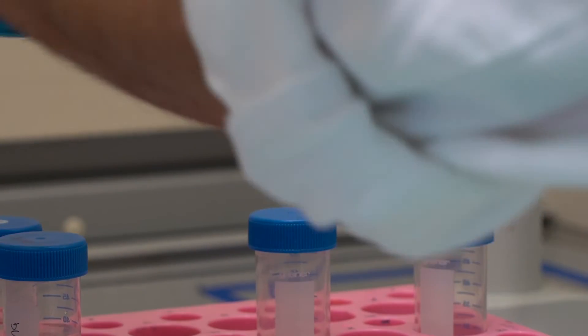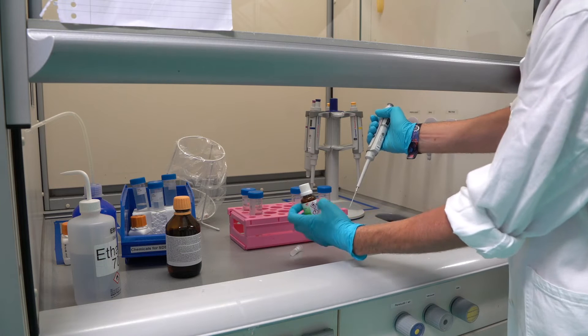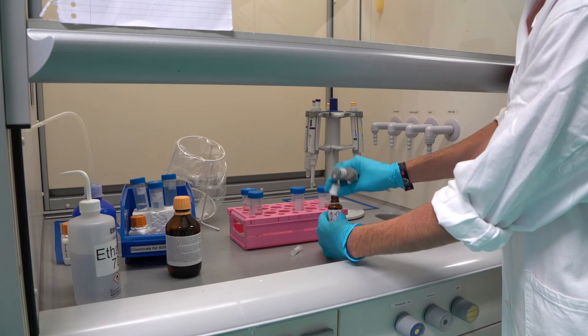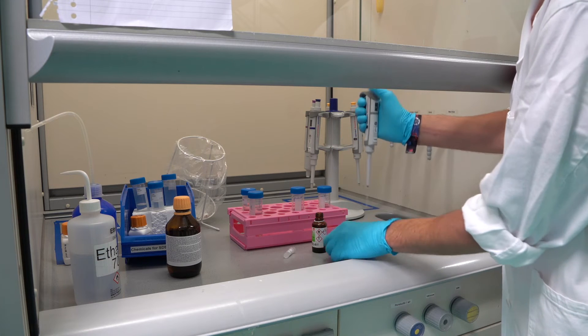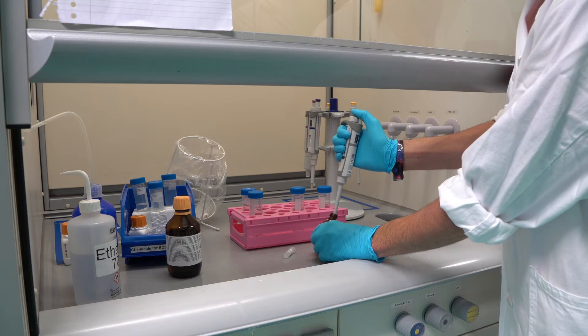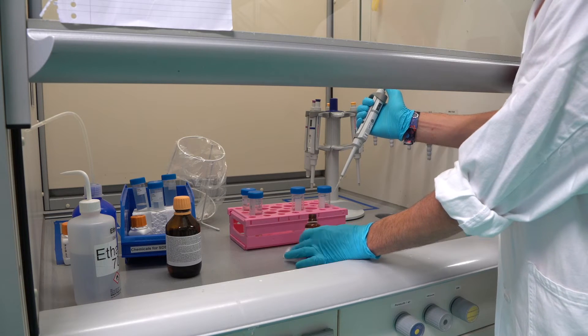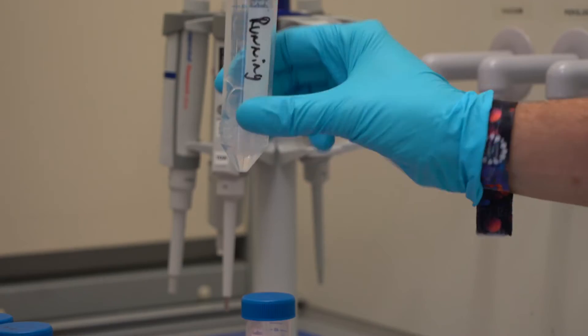Prepare the running gel in a fume hood. Calculate the volumes needed for making a gel. Pipette the correct amounts together in a falcon tube. Pipette the Temed and the APS into the solution last, as this ensures that the polymerization of the gel will occur. Mix the solution by inverting two times.